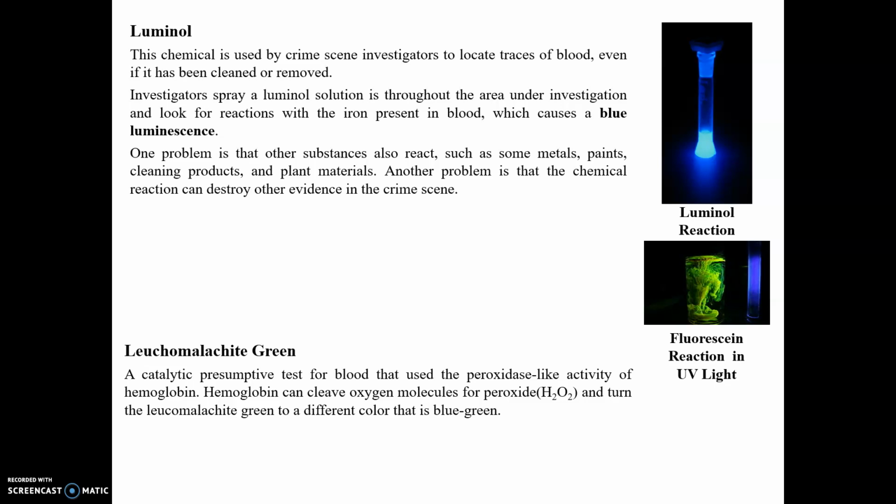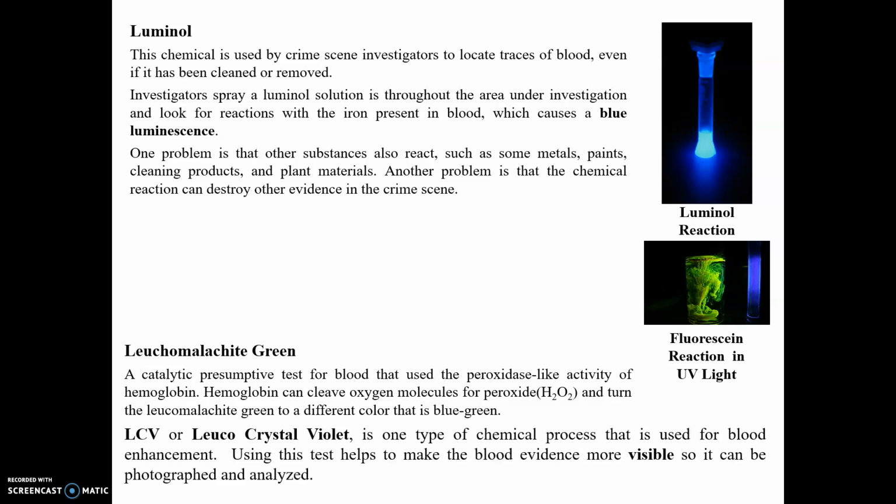One of the problems with luminol is that it does react to some metals, paints, cleaning products, and some other plant materials. The other problem is that when you spray the chemical luminol onto blood, if you overspray, then you will not be able to use that evidence for future tests because it can potentially destroy other evidence in your crime scene. So on the right side, you will see a luminol reaction. I'm probably going to try and set up a demo so that I can actually show you guys what it looks like, but we will get there.